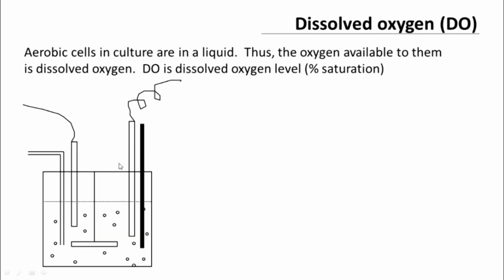So this is the bioreactor here again, the schematic of it, the stirrer as we have seen earlier, the medium in which cells are growing, maybe the DO probe, pH probe, the air inlet, and a temperature probe.